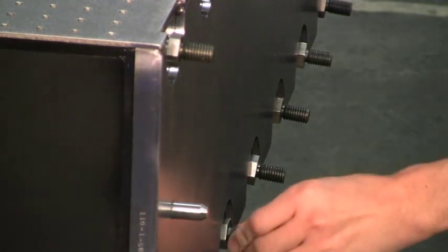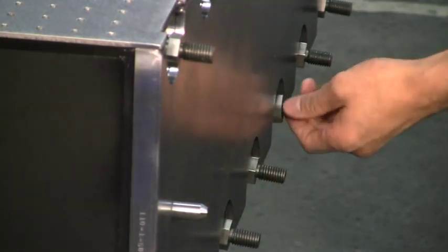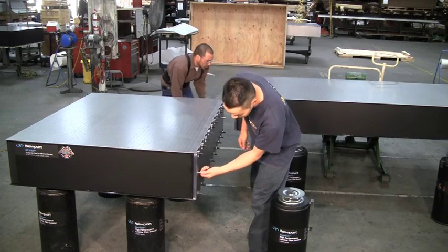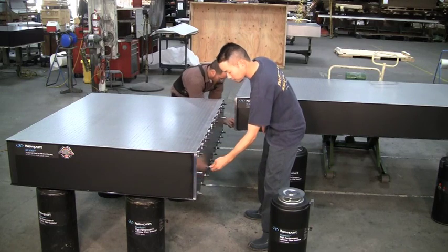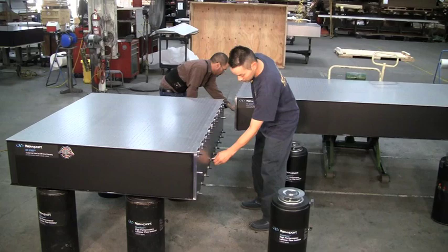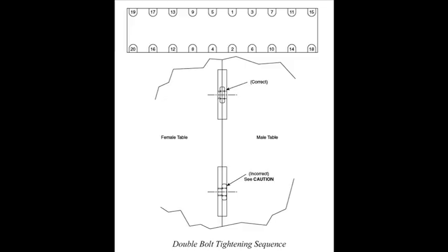Newport doubler plates are matched sets that are fastened together during the table construction process to assure that they mate together during final assembly. Also be certain that the matched sets are being assembled correctly for multi-section table systems. Contact Newport if there are any components that may look damaged for repair instructions. Refer to the recommended bolt torque sequence in the installation guide, and if needed, note the recommended sequence on the table surfaces using a pencil prior to joining the sections.